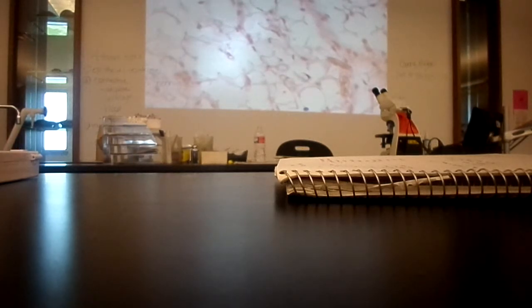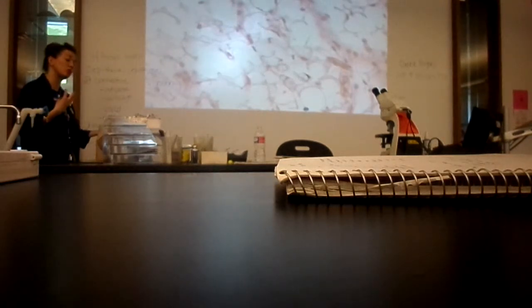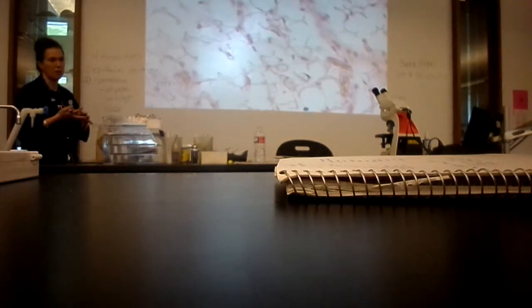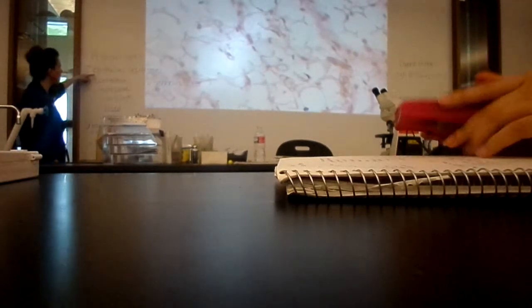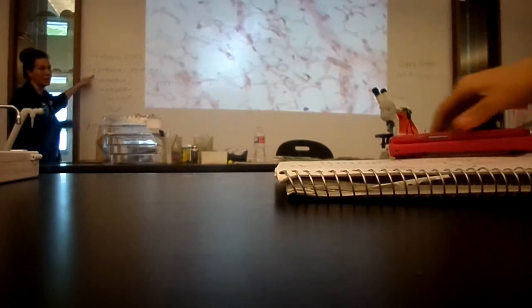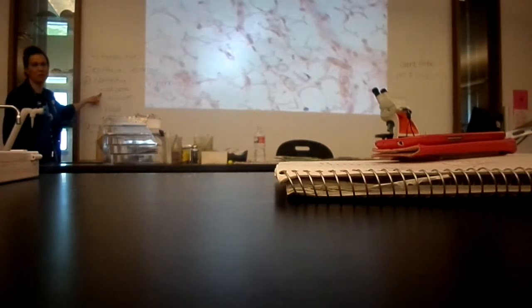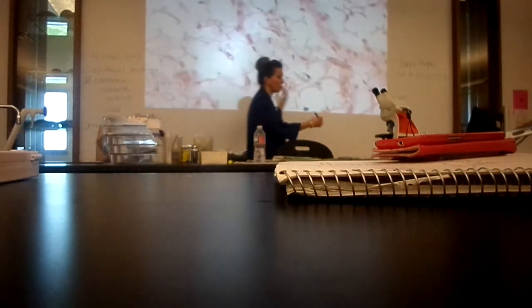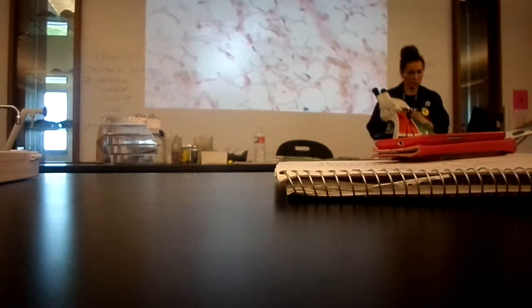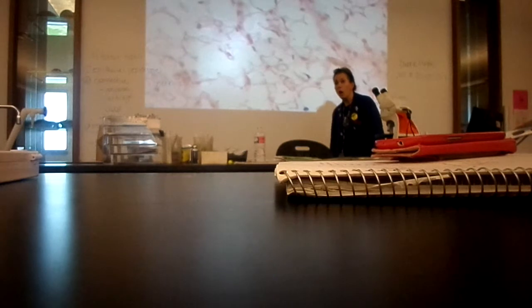So the skin is an organ made up of different types of tissues and structures. We saw most of the structures in the dermis: the glands, the hair, the muscles. At the top layer we saw epithelial tissue, and at the bottom we saw an example of a connective tissue, which is fat. Any questions? So all fat is adipose? No matter where it is, fat is adipose. It's in different locations, and it's a tissue. It's connective tissue.